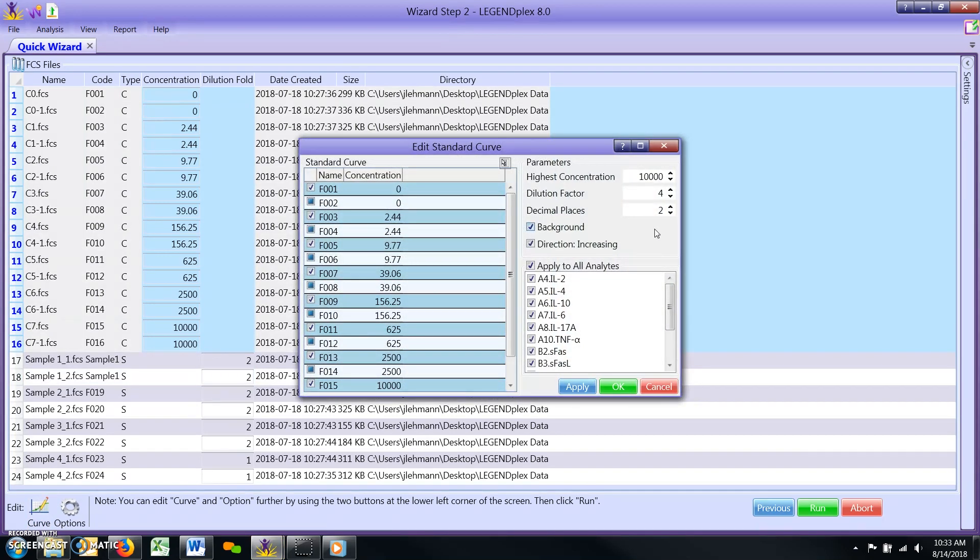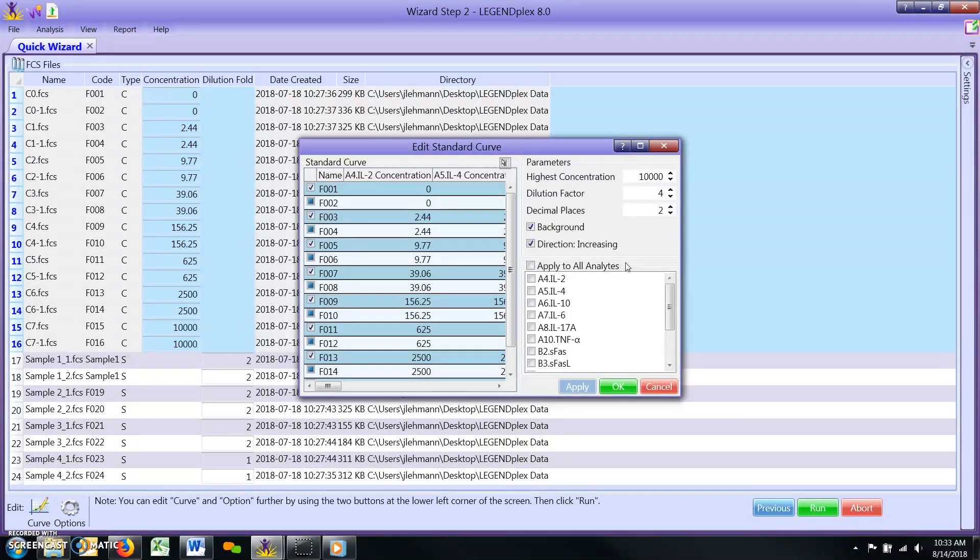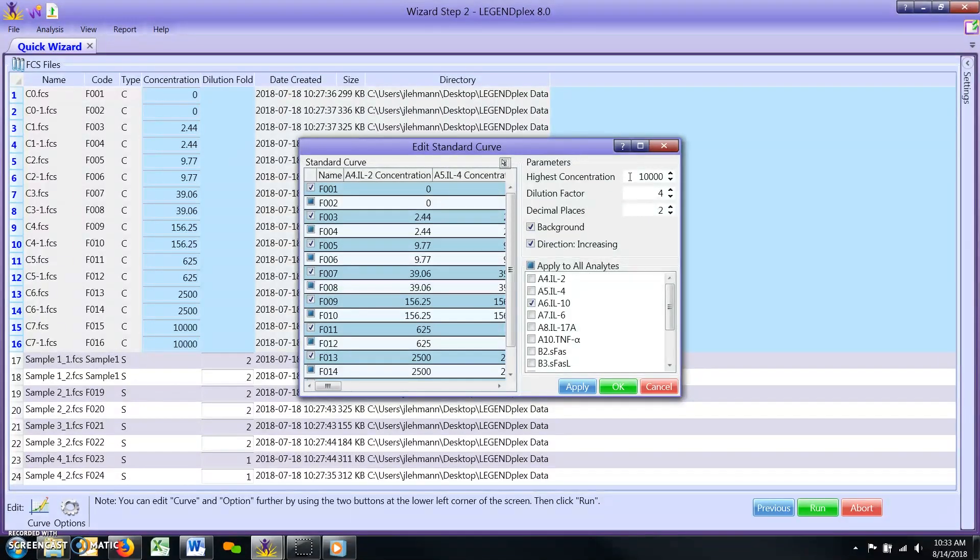Begin by unchecking the apply to all analytes box found near the midpoint of the window's right side. Next, check the box for only the particular analyte that you wish to change. In the highest concentration box, enter the value provided by your assay's certificate of analysis or manual.